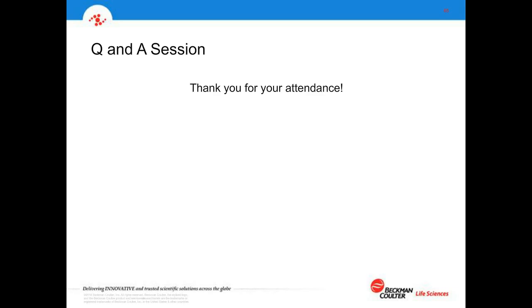That's going to tend to be a flag to regulators in those industries that your instrument is not really up to snuff, up to what should be done, and therefore the results of the test are perhaps called into question, which generally with regulators is not a good idea. So the direction here is trying to give a bit of leeway, you might say, in the first years of the implementation. But I know regulators are going to be looking at these requirements, and if you put that on the report, it's probably going to be called into question. So not a wise way.